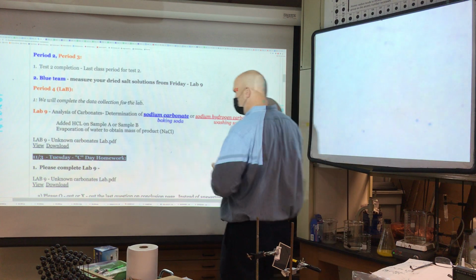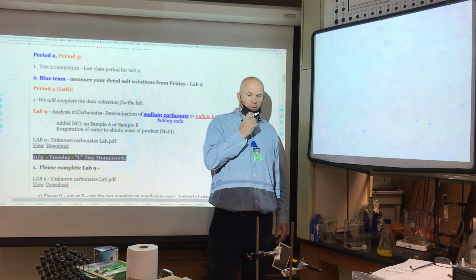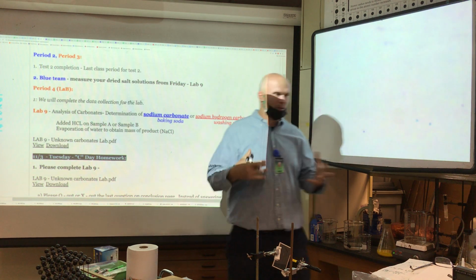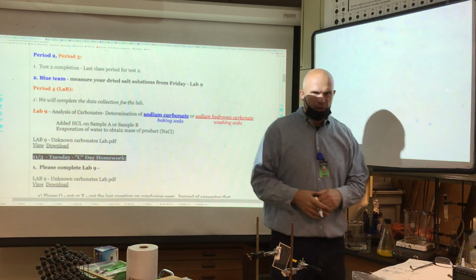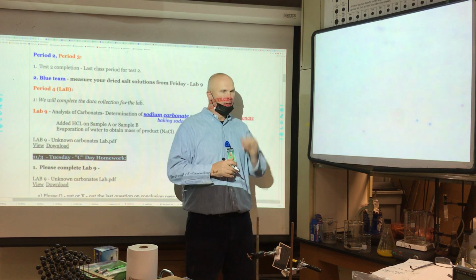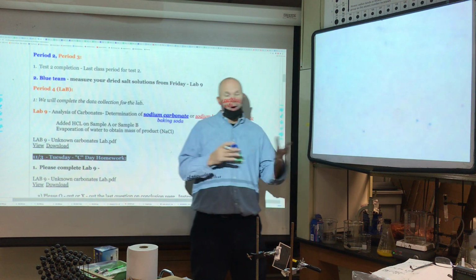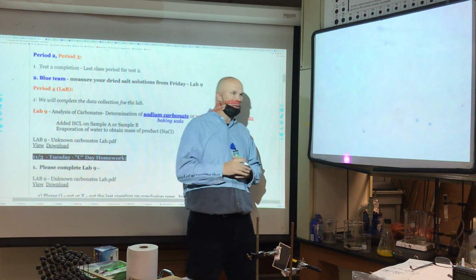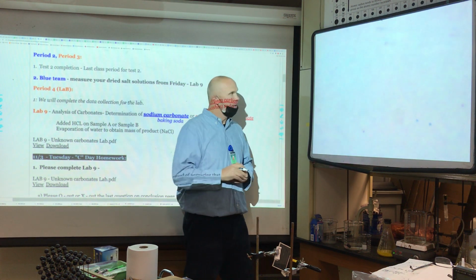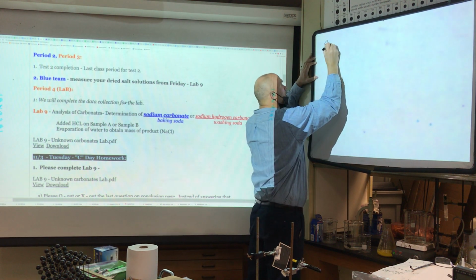All right, Lab 9. So the whole point of Lab 9 is to use our balanced chemical formulas, our chemical writing, our stoichiometry to identify what our white salt is. Now, I'm going to give you either A or B. Okay? We don't know what A or B is. You're trying to figure that out. So I'm going to give you sample A or B. They could either be sodium.